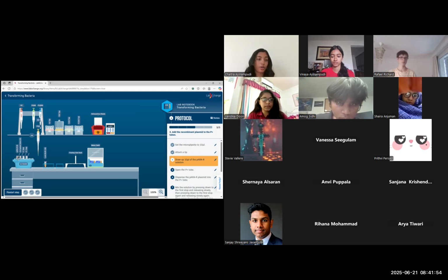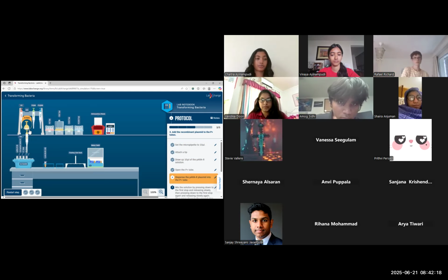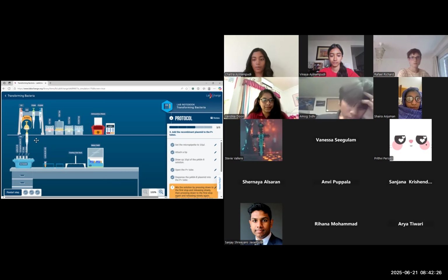And if you're wondering how to open it, you just click on the tube. Maybe that is a common mistake right now, or an issue that you guys might be seeing. And now, like mentioned before, we're going to dispense it by going to the first stop, the same that we did before. And now only for the P plus tube, we're going to put the plasmid into it. And now we're going to switch our tip. And that is how we're going to end up mixing it.